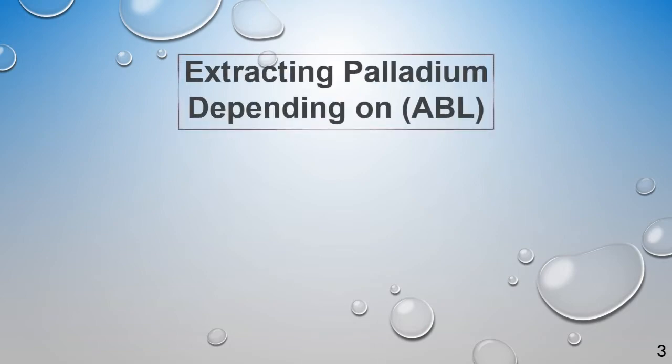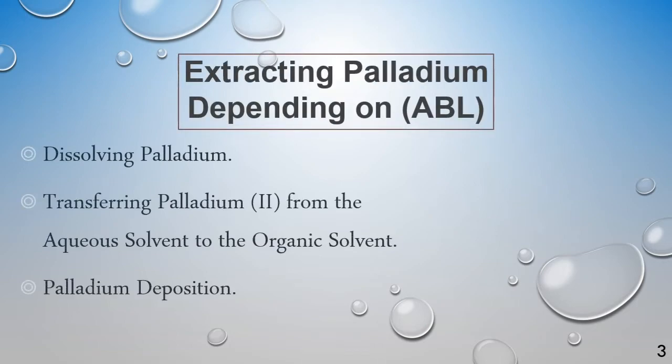Let's go now to 3 steps to extract palladium. The first step is dissolving palladium. The second step is transferring palladium from the aqueous solvent to the organic solvent. The third step is palladium deposition. And we'll go into details now.